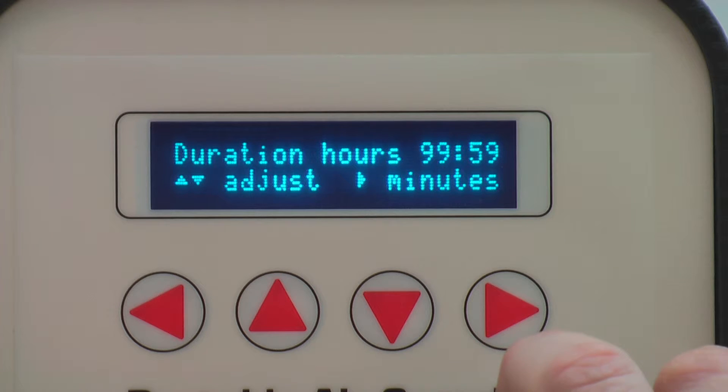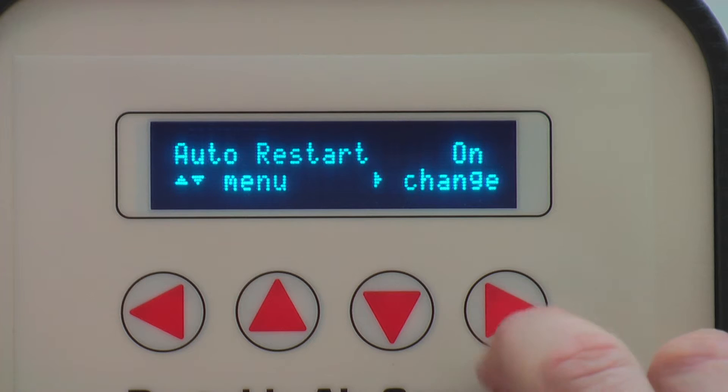The first section will allow you to adjust hours of operation. Press right to move to the minutes. Once you are happy with that, you can press right again to save the settings.